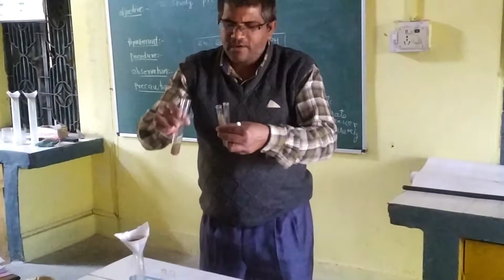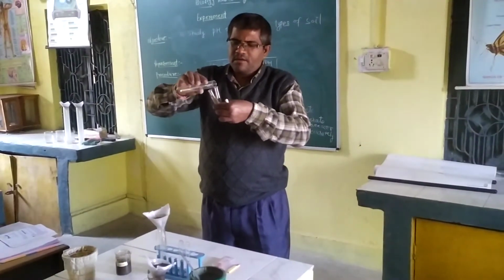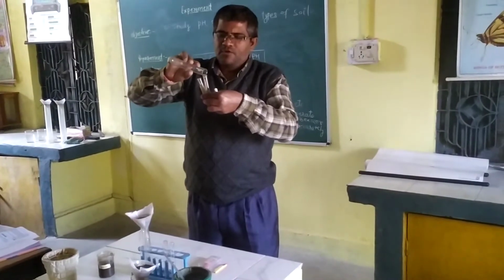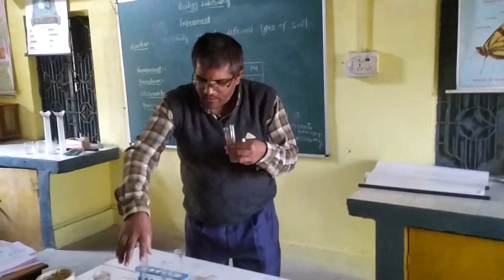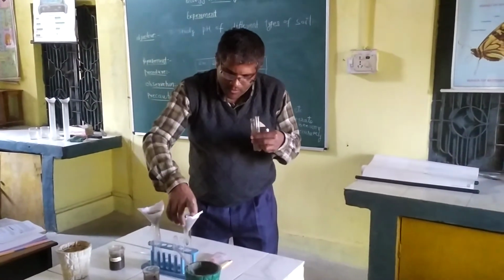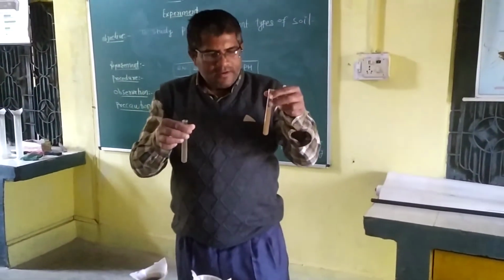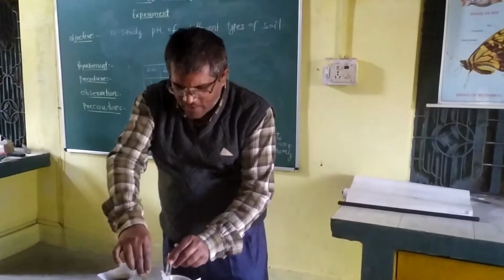We have to take it with another small test tube. So thus we have the soil sample of garden as well as roadside soil.